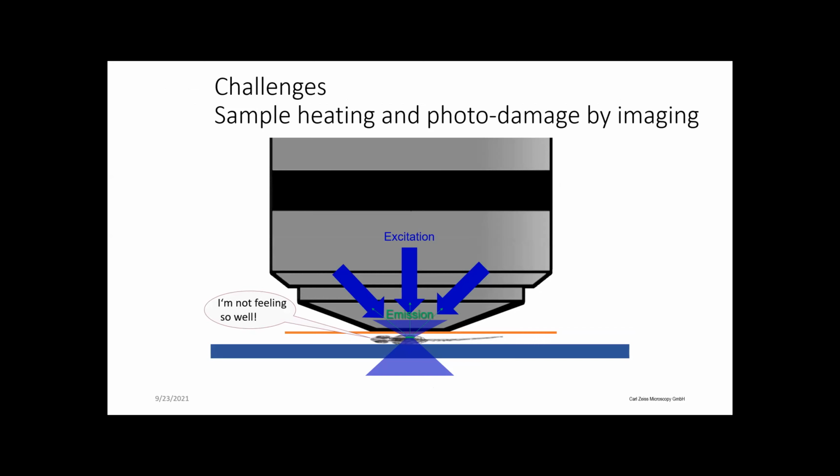Plus, through this high NA you concentrate all your photons within that focal plane into your oftentimes living sample. We talk about clearing and expansion here, so not much is living, but these instruments are originally also made for live organism imaging. So you concentrate all your photonic power and load into a small focal volume, which leads to sample heating and photo damage.